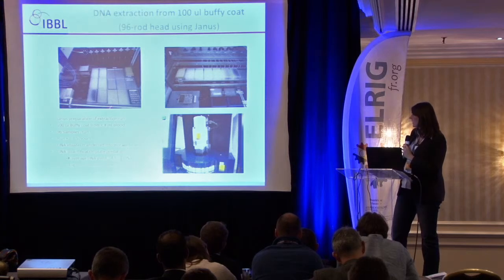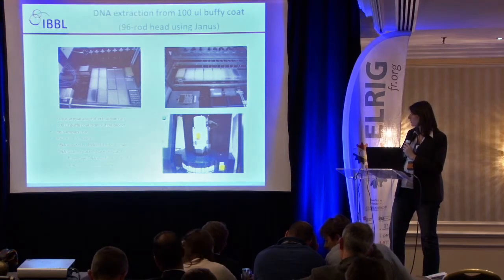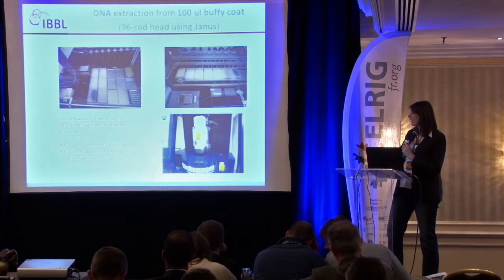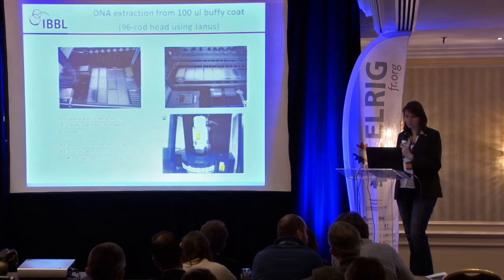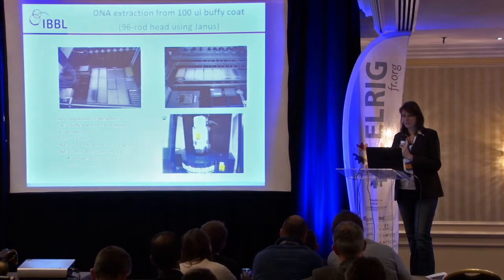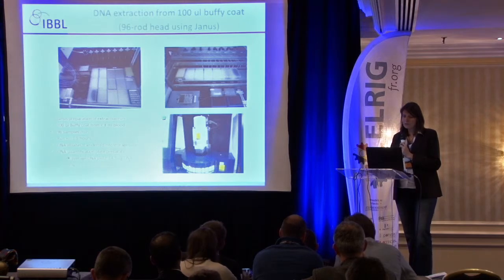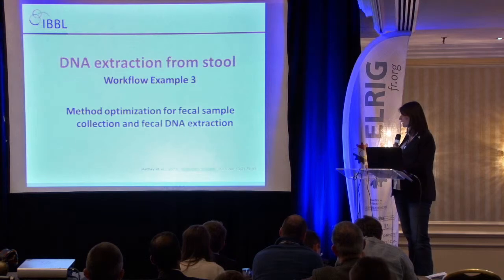So, okay, I mentioned already that Janus is able to transfer the eluates from the tubes into the storage tubes. So this is another workflow where we have low volumes and the 96 rod head. So let's now move on to another sample type, which is the stool sample.